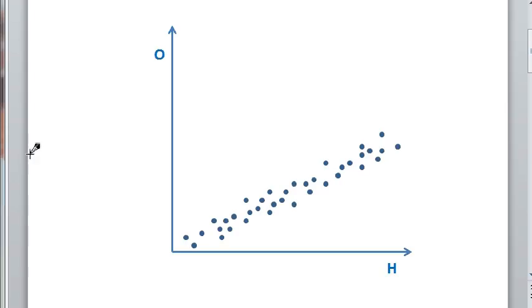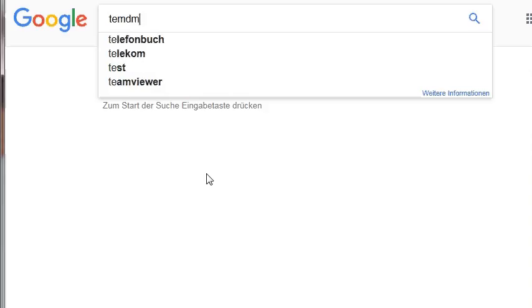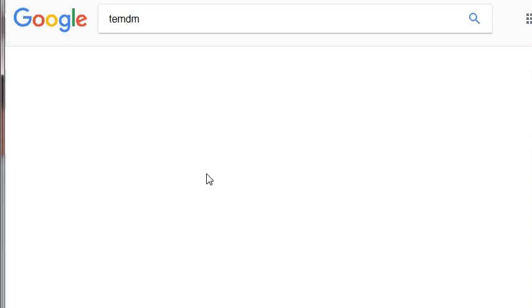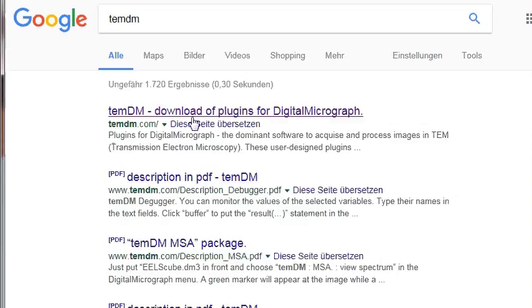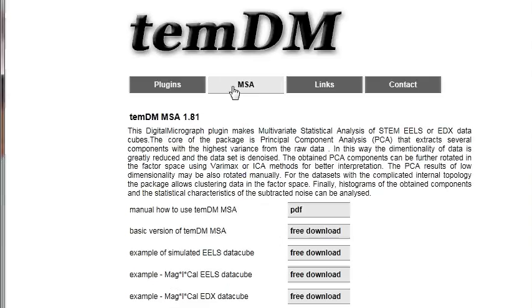The new package is nothing but a plug-in to Digital Micrograph. So where to find it? We go to Google and type TEMDM. We localize the TEMDM website and choose the MSA page. MSA stands for multivariate statistical analysis.